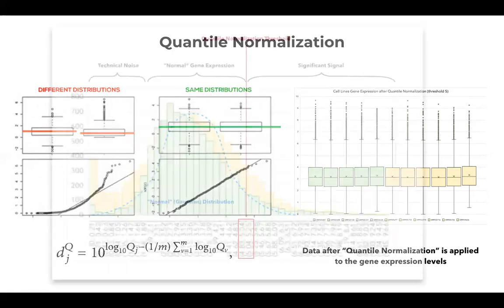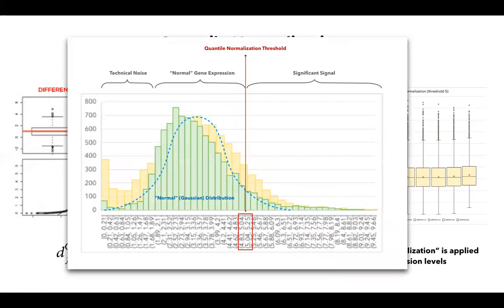So you might want to do this for only one portion of the data, and we chose a threshold of 5. So why did we choose a threshold of 5? Because many of the genes have normal gene expression, which you might not be interested in, because while collecting data from the sample at a particular state, many genes are functioning normally.